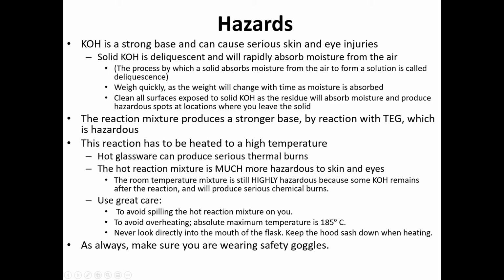Something to note is that solid potassium hydroxide can rapidly absorb moisture from the air, and this is what causes it to be a little bit sticky. So when you weigh potassium hydroxide, it's a good idea to weigh it quickly, because the longer you take to weigh it, the more moisture it will absorb. And just make sure to clean any surfaces that have touched the potassium hydroxide. That way we can clear out any of these hazardous spots.